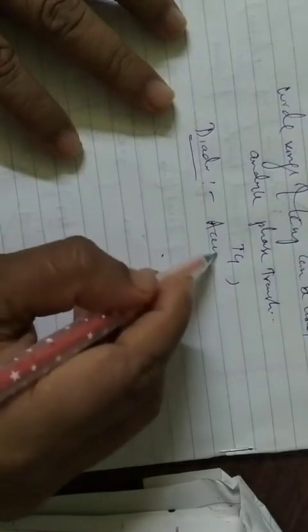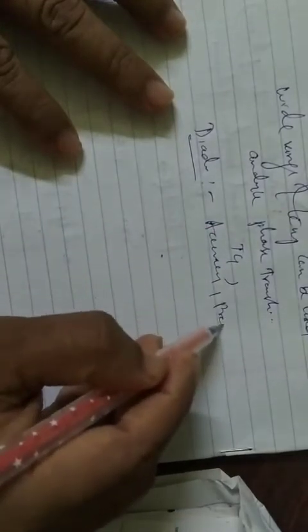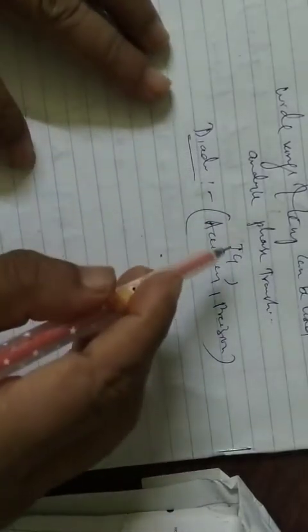If you see the disadvantage, the only thing is that accuracy and precision have somewhat of a negative impact on this DSC, since the sample is taken in a metal container, so getting proper accuracy and precision is a little bit of a problem here.